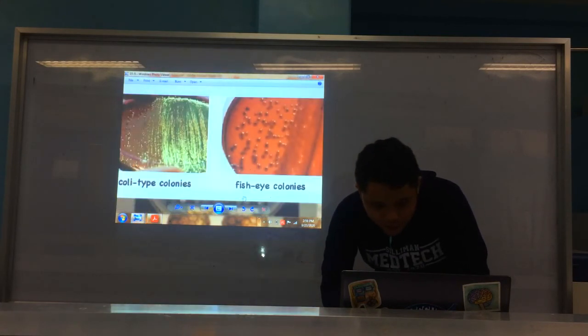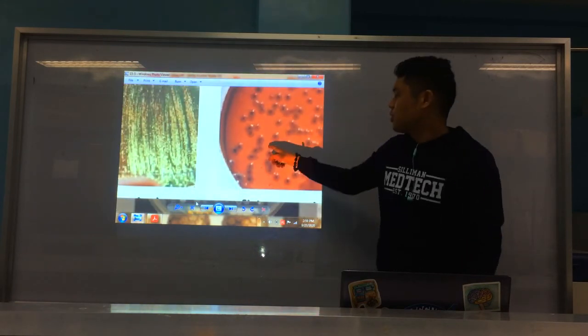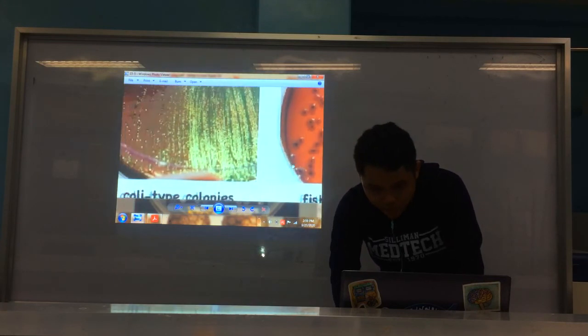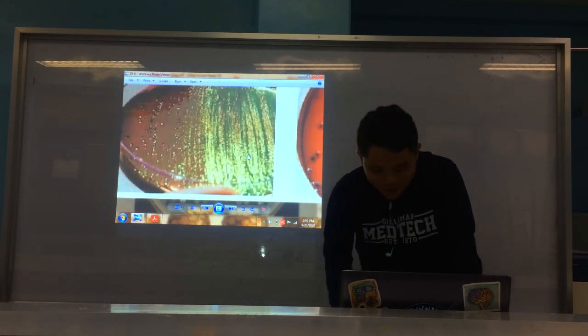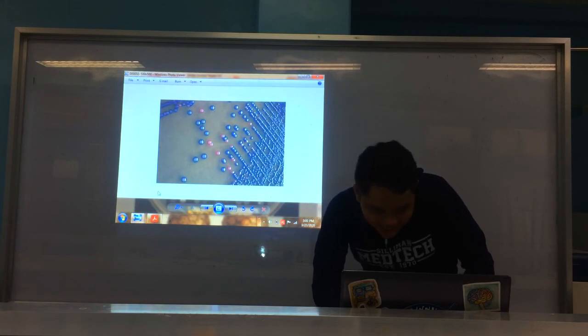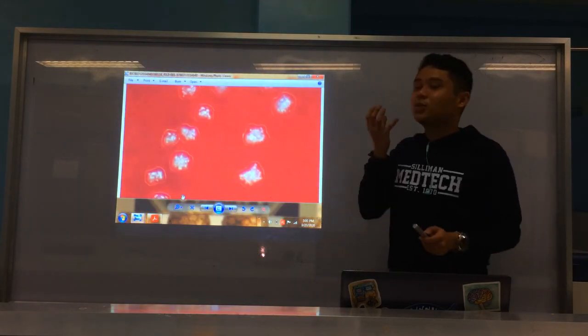Okay, so first one, this one, yes, di ba itong na-mention. Fish eye colonies, di kayo klaro. Pero siyang mga mata sa isda, okay? That's again Enterobacter. And for this one, again, green, metallic sheen on EMB, that's, wala nang iba, that is E. coli. Okay, alright. Next one. You have, not this. Sorry, mali. Okay. All right. This one, this is what we call molar tooth colonies.